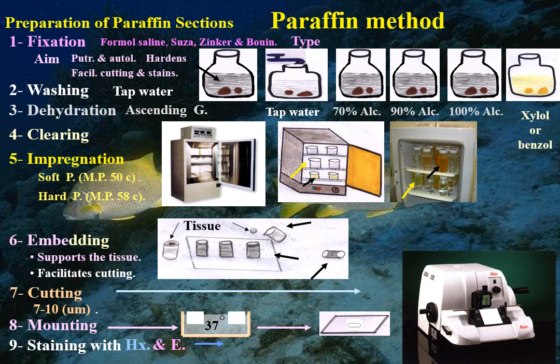The reverse is the case for structures that accept the red color of eosin. They are called acidophilic. They are basic in nature. Nuclei are always basophilic because of their content of nucleic acid. Cytoplasm may be acidophilic or basophilic. Basophilic cytoplasm indicates activity due to the presence of nucleic acids.